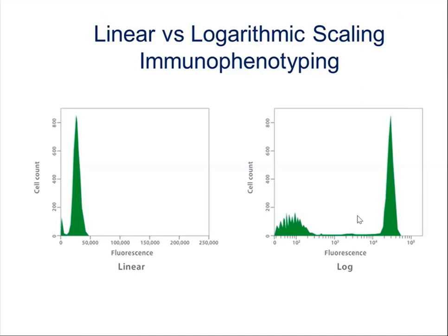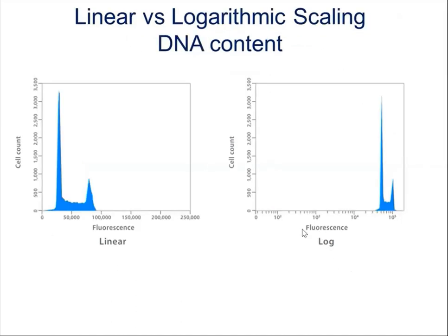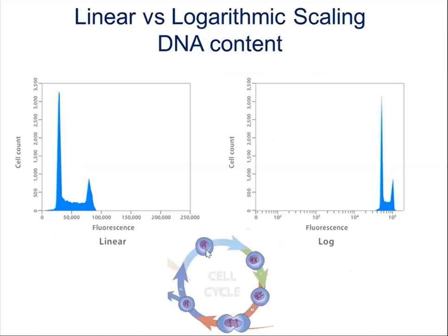See, I'll tell you what it is. DNA ploidy. Perfect, super, ploidy. Excellent. So the ploidy is the one which will have a fluorescent marker in a linear scale. The reason is, I'll tell you what. Take this. In a cell cycle and ploidy analysis, the cell which is in G0 phase or G1 phase will have 2n chromosomes, correct?